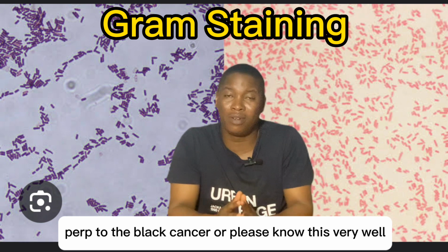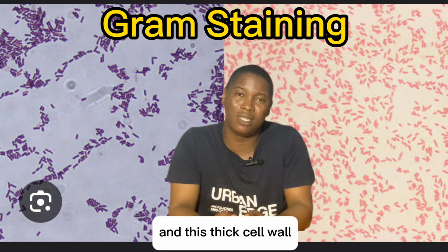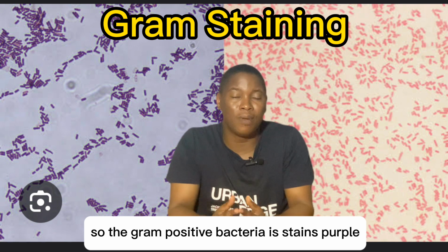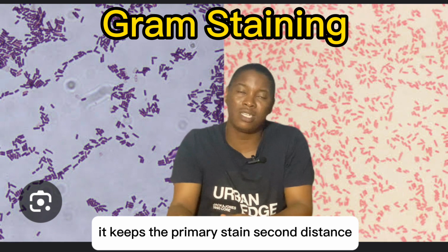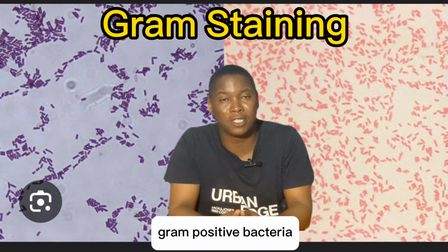Please note this very well. The gram-positive bacteria have a thick peptidoglycan cell wall, and this thick cell wall is able to retain the primary stain. So the gram-positive bacteria stain purple. It keeps the primary stain. The secondary stain is not able to displace the primary stain from the gram-positive bacteria.